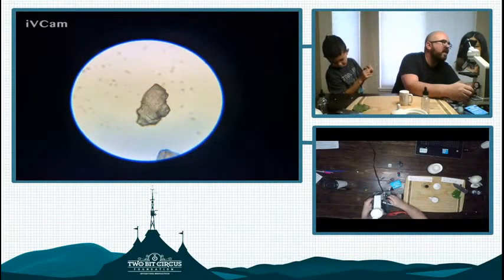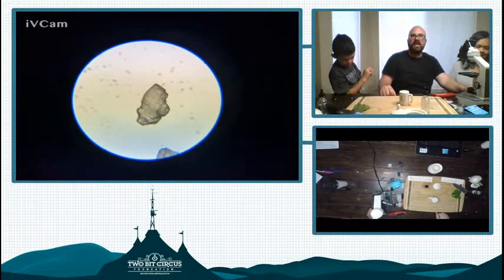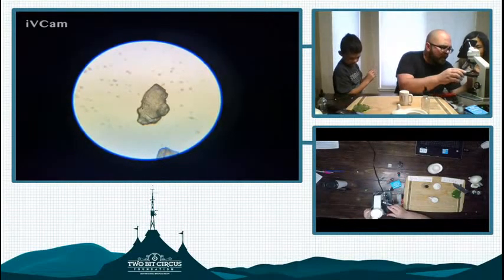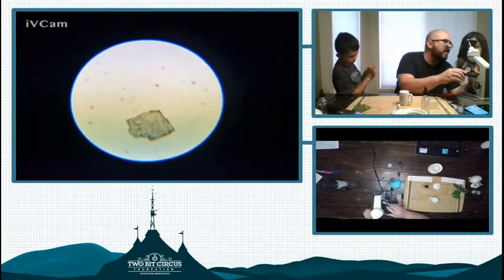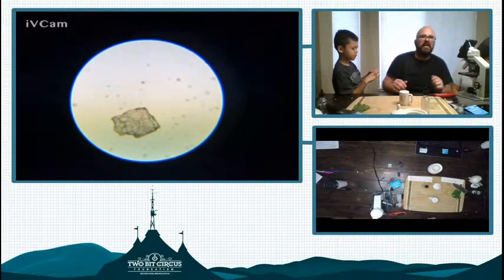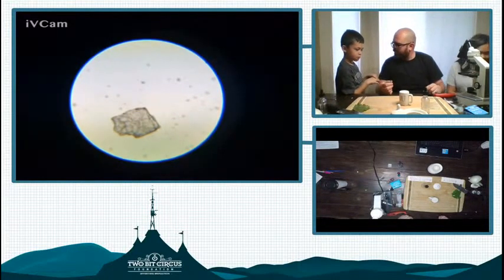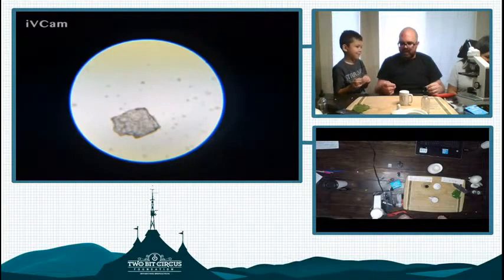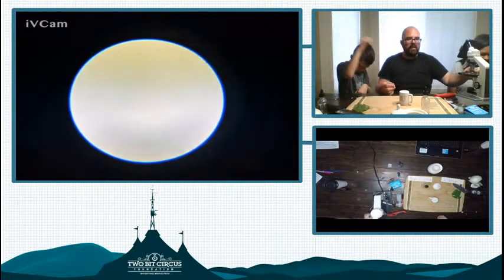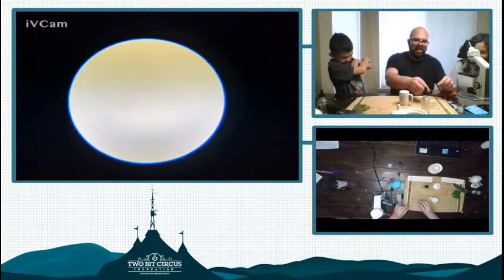So here we have a pretty good image of a salt crystal. It has a unique structure. Each piece of salt, I'm sure, has a little bit of variation in it. But it doesn't look like there's any patterns of cells or anything in there. So were you right about this one, Robert? Is salt alive? Awesome. So, Robert has only missed one, which is the cork, which is a tricky one so far.